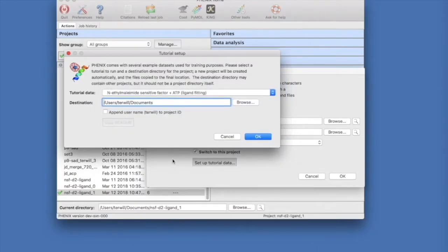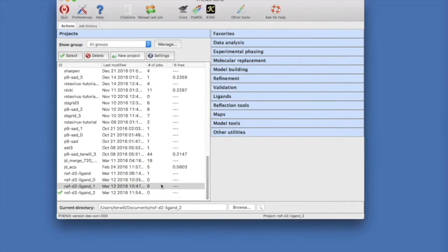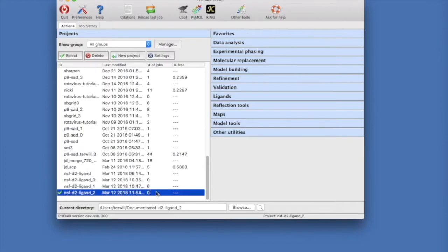Choose a suitable destination and click OK to copy the tutorial data to your directory. Now there will be a new NSF D2 Ligand project ready to use.